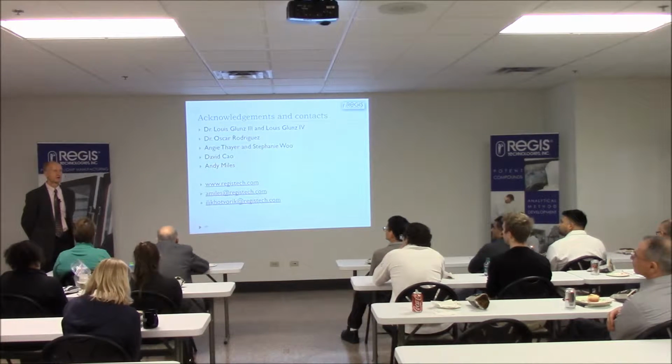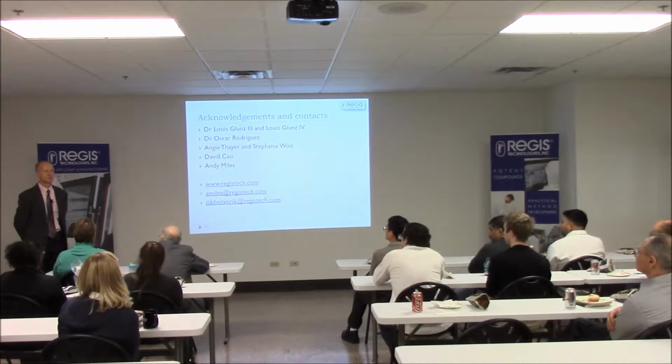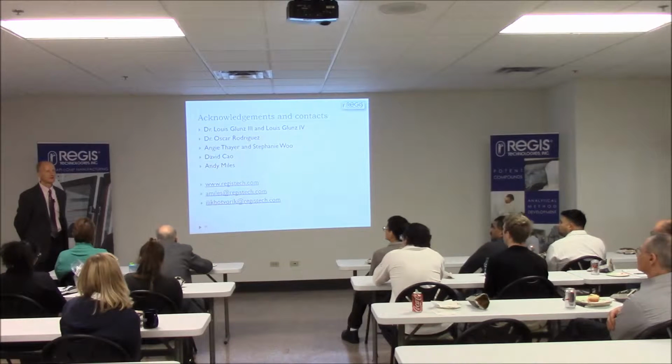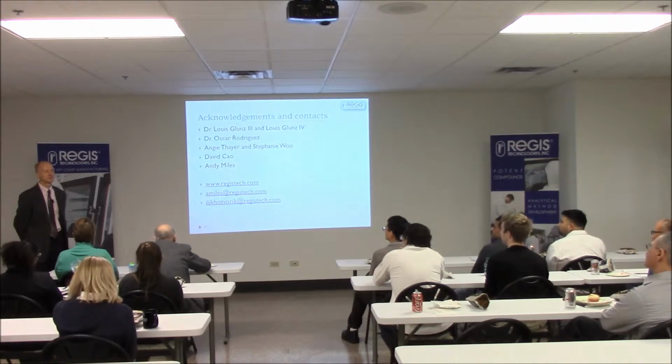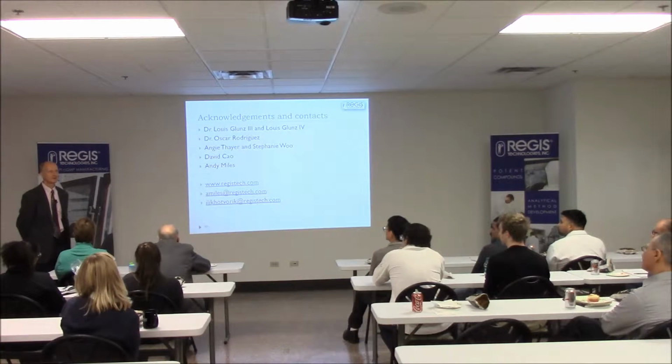Let's say you have a sample which has 50% of your desired product, maybe 60 and 70, and it would be sufficient, because then you can see dynamics and you can identify the signals which belong to your compound and discard the signals from other impurities. So in the best case scenario, you purify it to above 80%. If you're unable to do it, you can collect fractions which contain variable amounts, but you have to see dynamics to elucidate the structure of your compound.